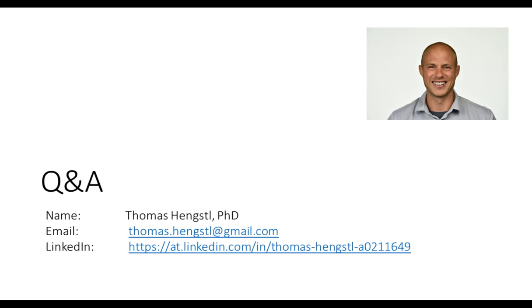Dr. Hengstl, our first question is, does this technology also work for larger frameworks? So this technology also works for larger frameworks. The only thing that has to be validated is the qPCR. We tested this technology with 6 different frameworks, and for one of the frameworks, it didn't work at all.